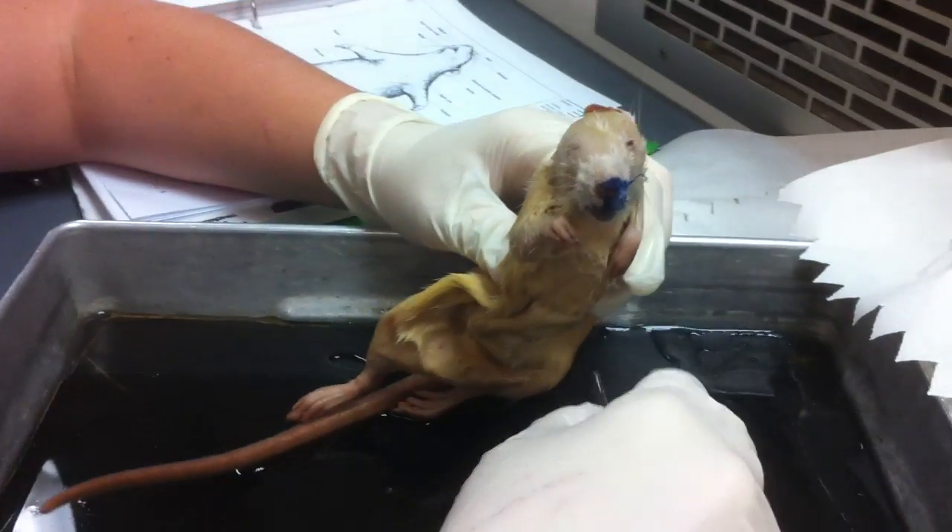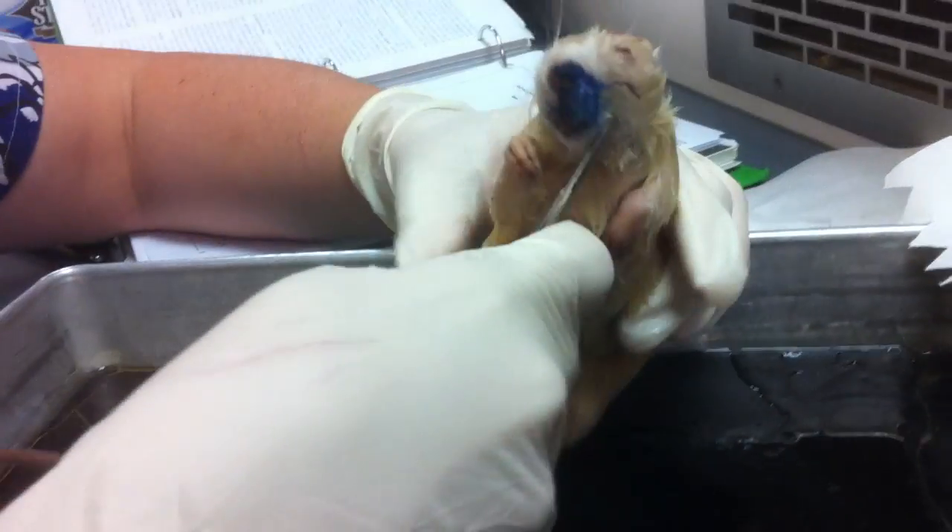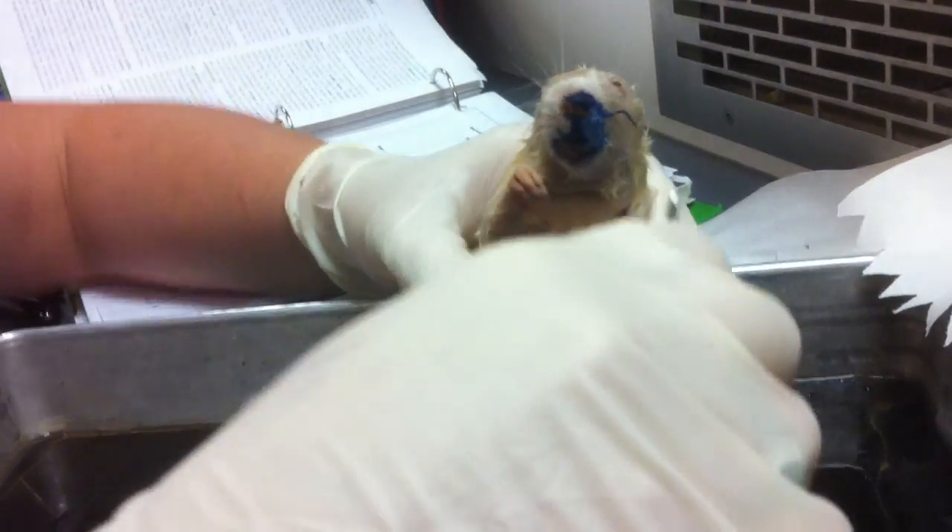This is Delilah. She's our little dissection rat. This is going to be a video of the external anatomy.